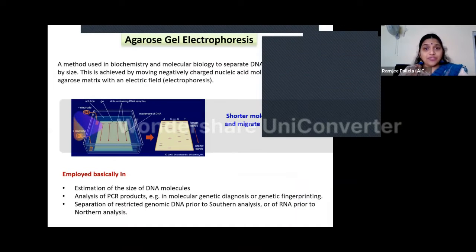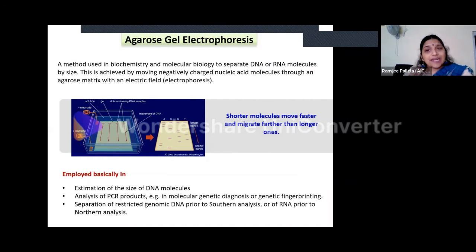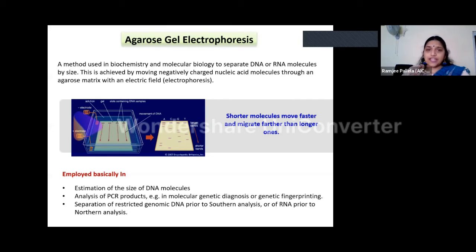It is a method used in biochemistry as well as molecular biology to separate DNA or RNA molecules by their size. So it is a size-based separation of DNA and RNA, which is done through gel electrophoresis. It is achieved by moving the negatively charged nucleic acid molecules through an agarose matrix under the effect of an electric field. Phoresis is migration, electro is electric field, and gel, of course, because it is made of agarose, so agarose gel electrophoresis.